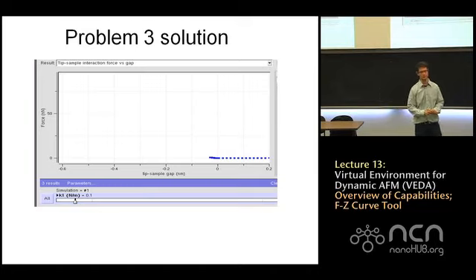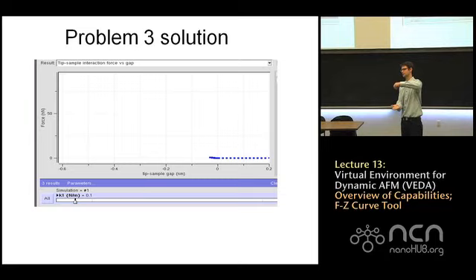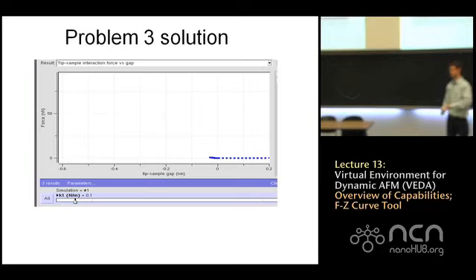And what you see is if you use the soft cantilever here for the stiffness, given the fact that the Z actuation is limited, we're not going to be able to indent the sample very much, and we're not going to be able to extract a reliable material property. Basically, the sample looks like a rigid wall almost compared to the cantilever. So we come up, we press on it, and we're not able to indent the sample at all. We're not able to extract any meaningful data from this curve, right? And that comes from the fact that practically the Z actuation is limited. If we could just extend it forever, then eventually we would come up with a curve, but we can't do that.